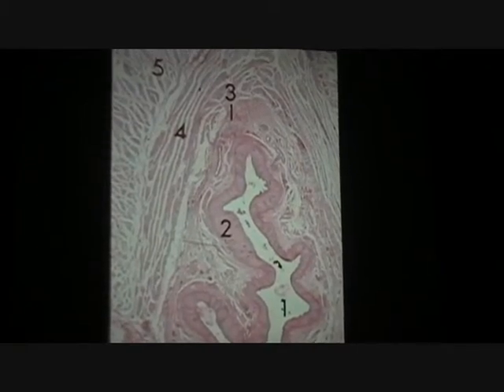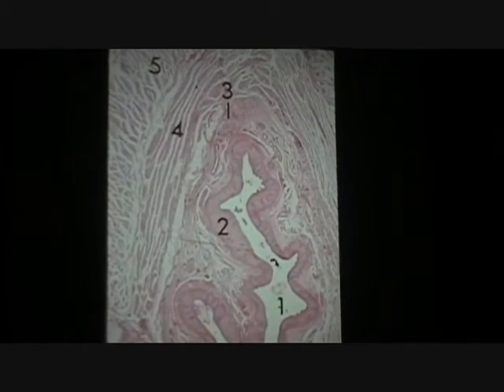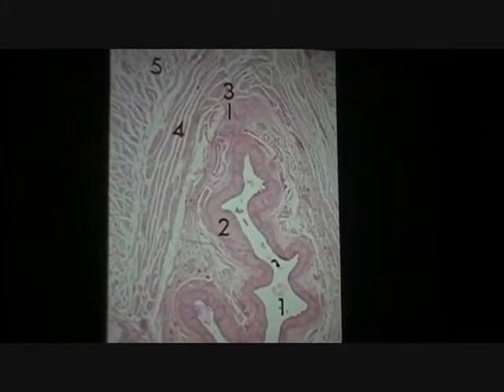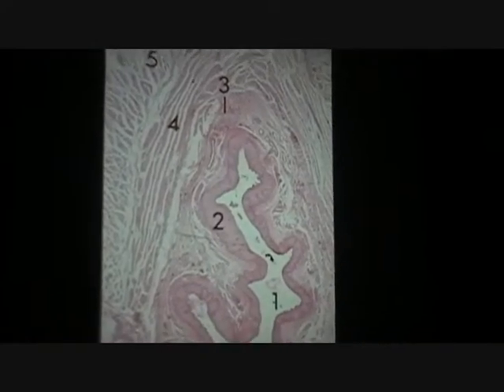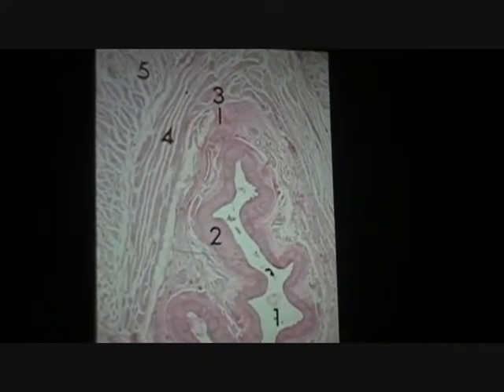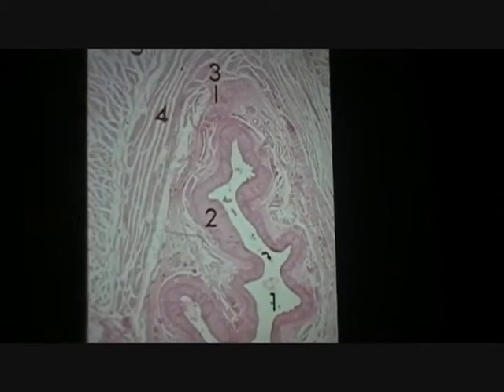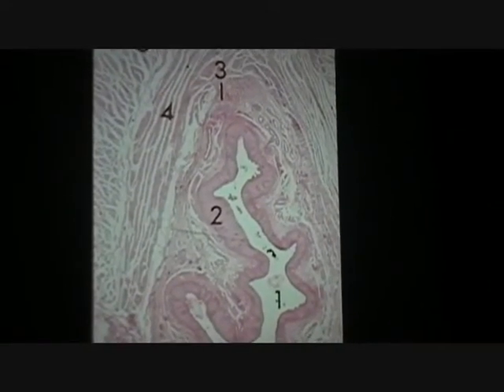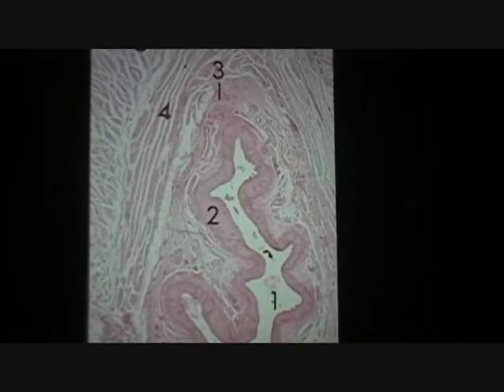Good, no villi. So now intestines out. Small intestines gone. You see crypts with goblet cells? Nope. So colon's gone. You see gastric pits within gastric glands? Nope. Nothing there. So now, there's only one thing left.